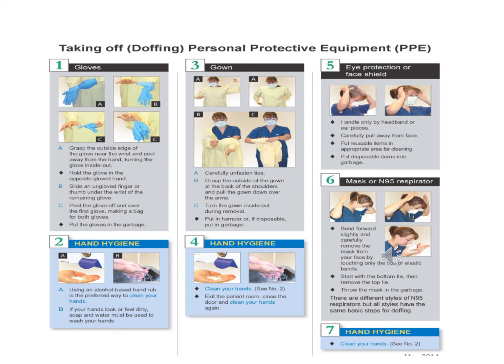So first, while you are taking off the personal protective equipment, you should remove the gloves. You saw that when you were putting on, or donning, the gloves were last because you want to free your hands.